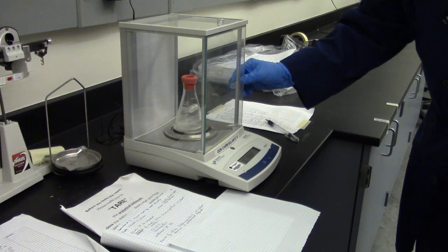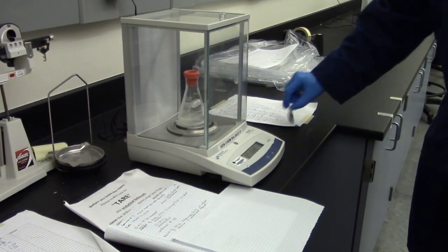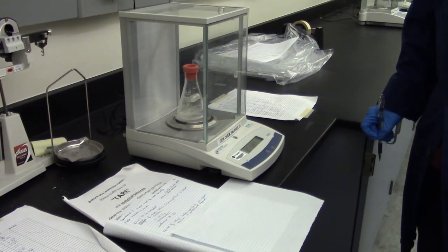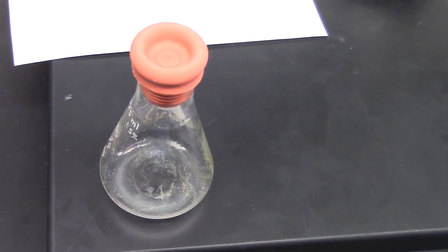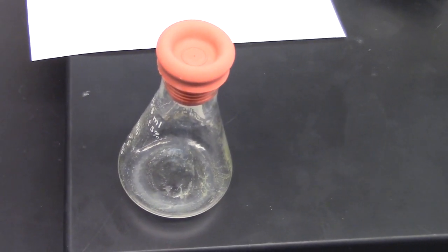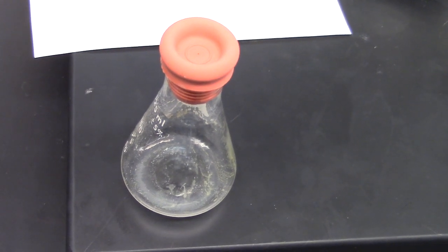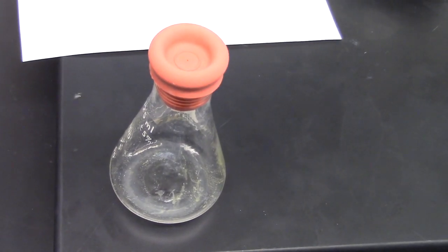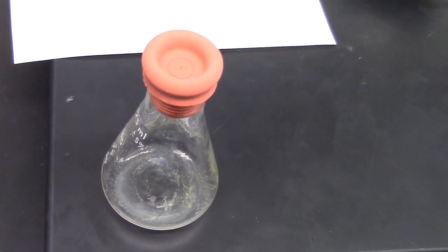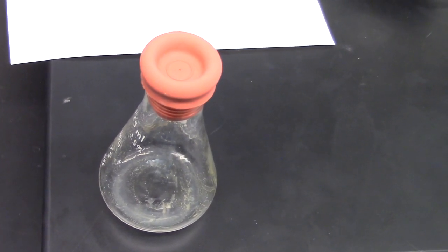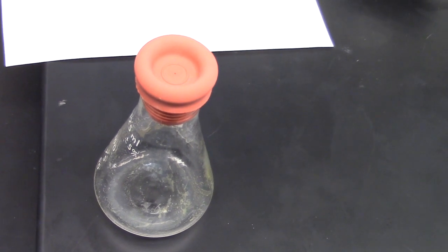You will return to the balance room to re-weigh the flask, septum, and condensed liquid. The condensed liquid occupies a much smaller volume than that of the flask, so the weight of the air is essentially the same as that in the first weighing. Therefore, the mass of the condensed liquid is found by the difference between the mass of the empty flask and the septum and the mass of the flask, septum, and condensed liquid.